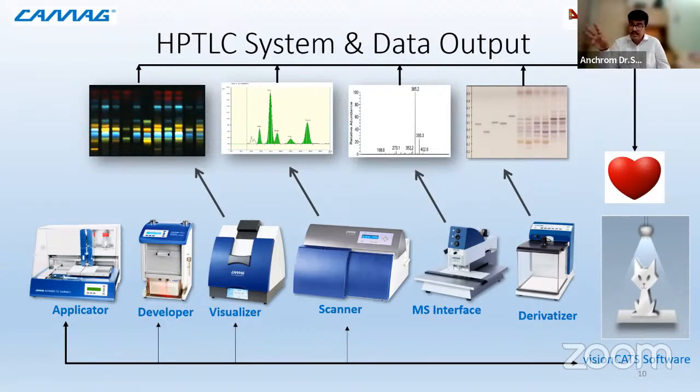The mass spectrometer is a sophisticated instrument. You have to first tune it to see whether it is responding to your requirement. For example, if I'm searching for an alkaloid, I first need to ensure that my instrument is tuned to give me a response for an alkaloid. If it is not, then even if I inject an alkaloid into a mass system, it may not show me the proper parameters, because there are many things in a mass spectrometer, like cone voltage. We are not here to discuss more, but the criticality in mass is much higher.